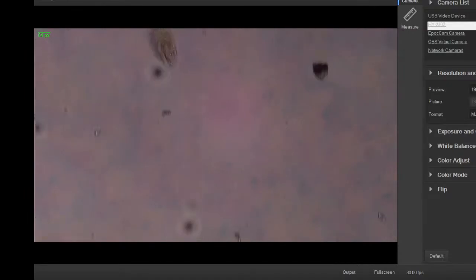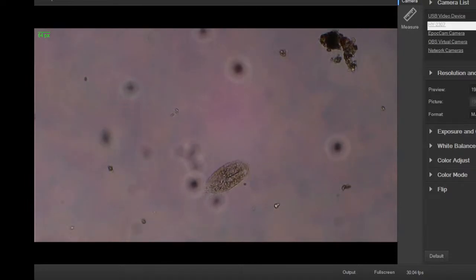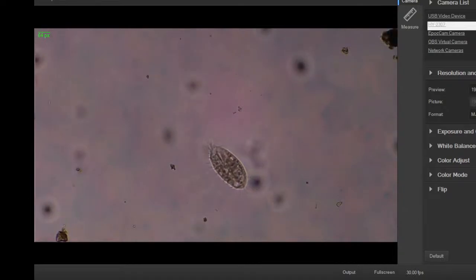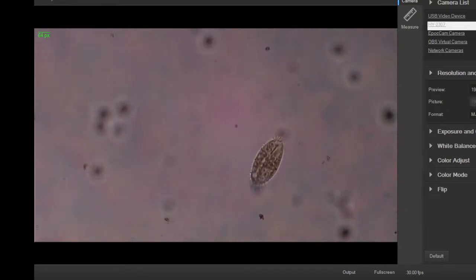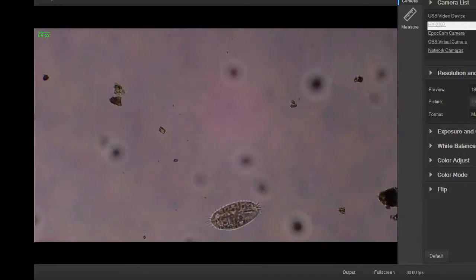accentuated cirri, which is the thicker versions of cilia at basically the top and bottom of the cell, the little points top and bottom, which is, you know, essentially, for lack of a better term, head and tail, because as you can see the direction they swim. The top part has like a little bit of a gullet there. You can kind of see out of focus.